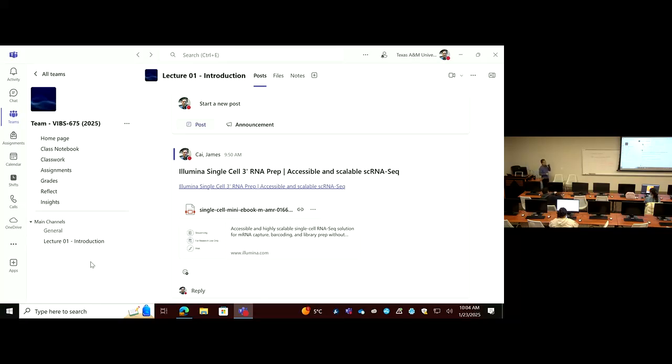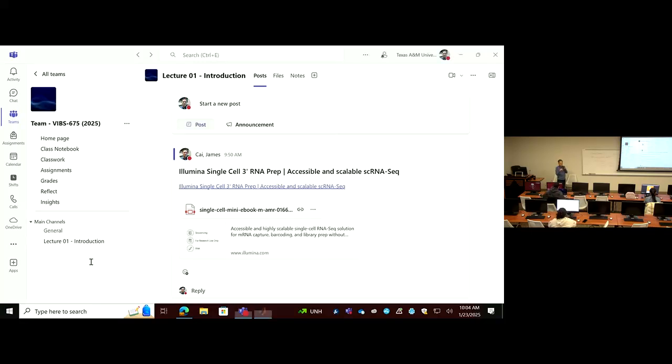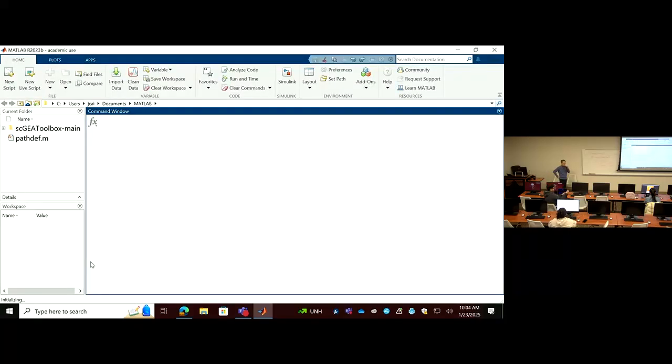Okay, today I will ask Shran, our TA, to come here to show you how to use the 10x Genomics cloud service to upload FastQ files you get from the sequencer, from the single-cell RNA-seq library, and then map to the reference genome, and then download this gene expression matrix file. So this step from raw data to matrix is a necessary step before we can work on the matrix of gene expression for the downstream.